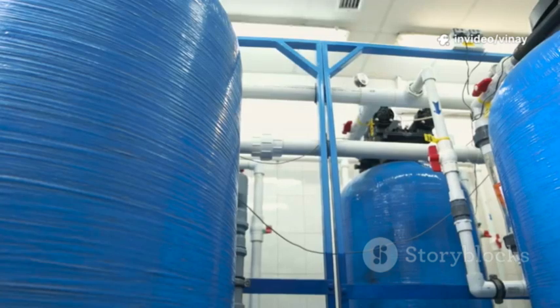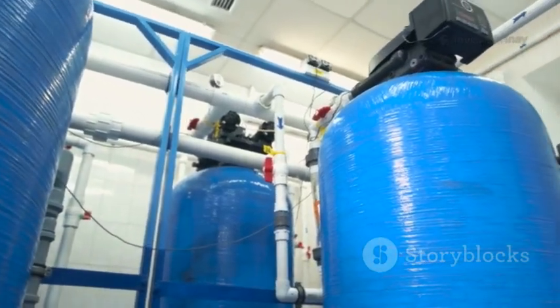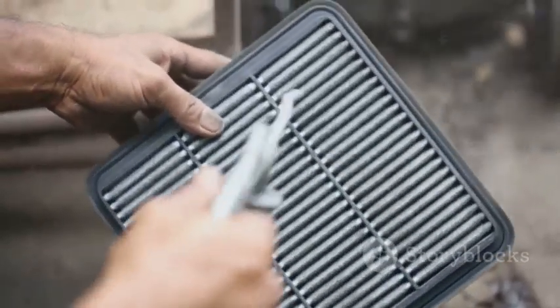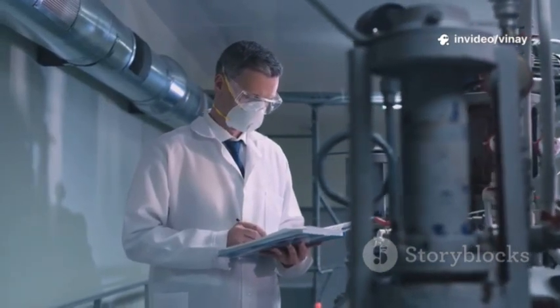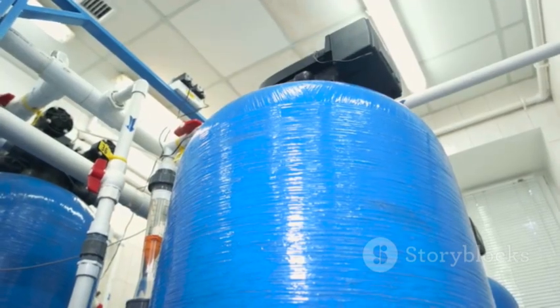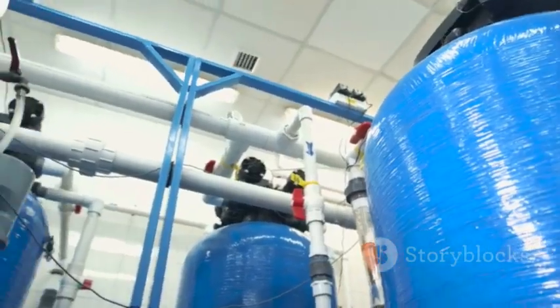The amount of gas that diffuses through the filter is directly related to the surface area of the filter membrane. A larger filter will naturally have a higher diffusion flow than a smaller one, even if they are both perfectly intact. The filter manufacturer does extensive testing and tells us the maximum acceptable flow rate for a specific filter size and type. For example, they might say that for a 10-inch filter cartridge at a test pressure of 40 psi, the forward flow rate should not be more than 20 milliliters per minute.